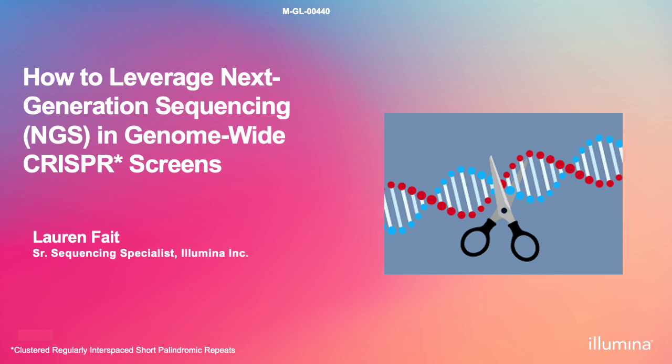Today, we will walk through an overview of what a genome-wide CRISPR knockout screen entails, as well as a few factors in order to ensure success. So let's go ahead and get started.